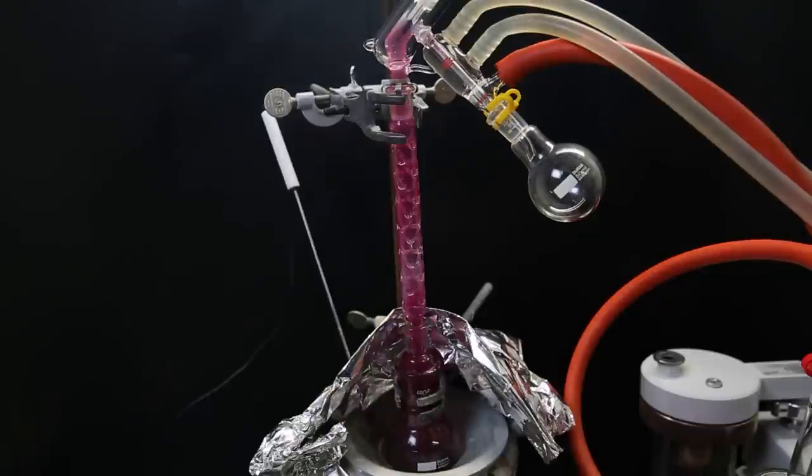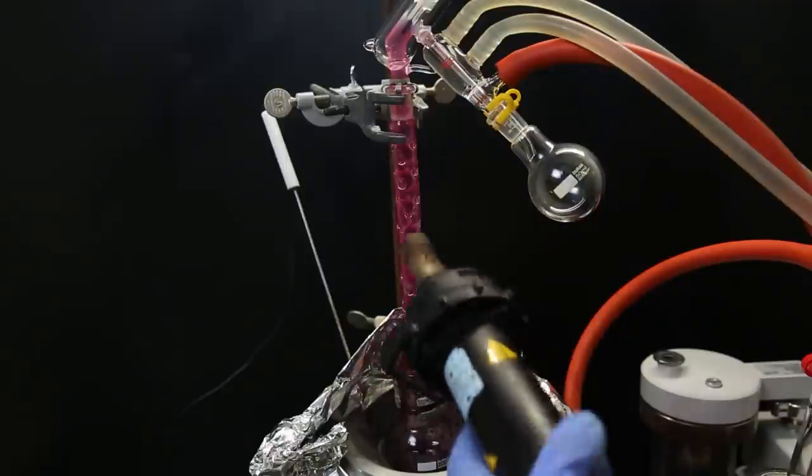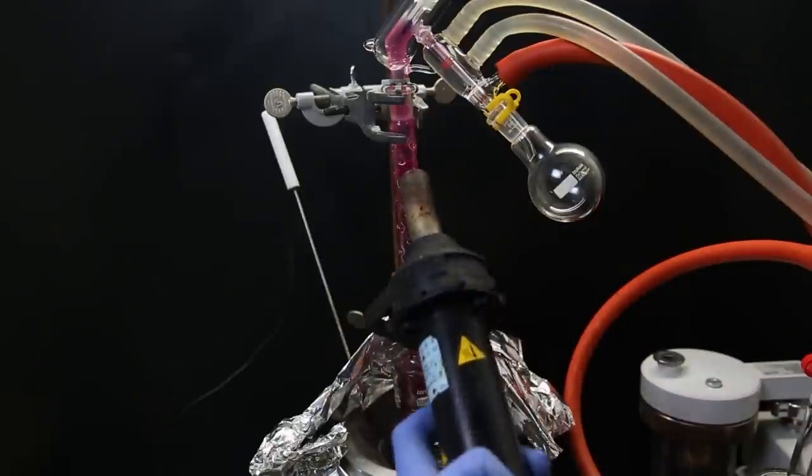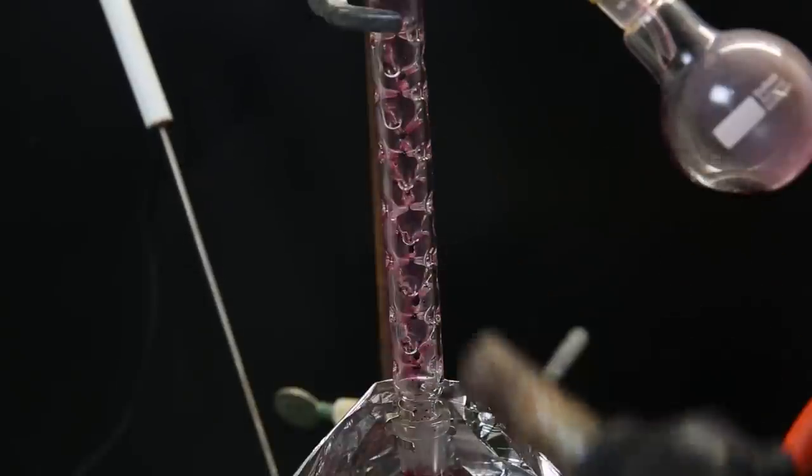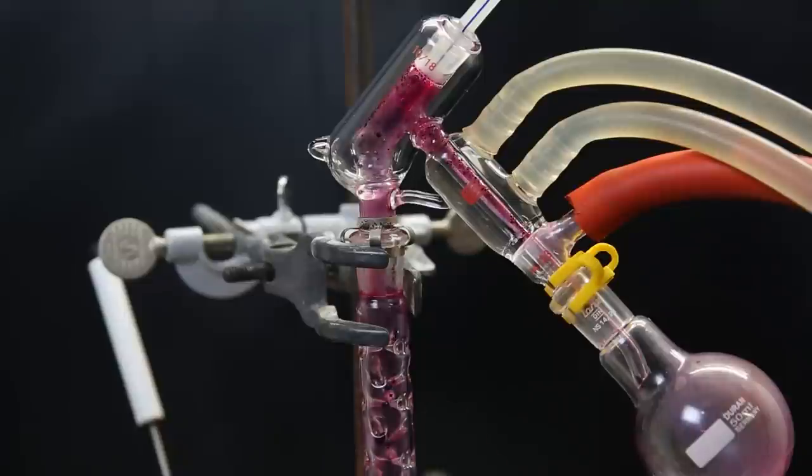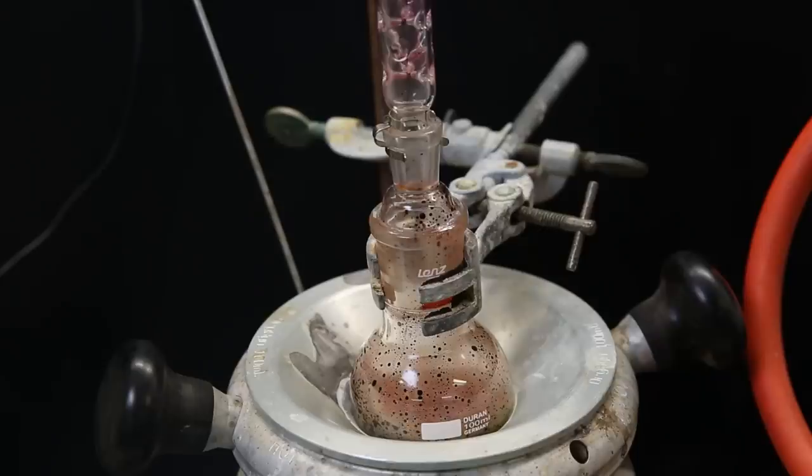After a while, it starts boiling, and a pink-purple condensate is forming in the apparatus. I keep assisting it with a heat gun, and we see the pink thiobenzoyl chloride starts distilling over, and collecting in the receiving flask. When it is done, all that is left in the flask is a bunch of crap.